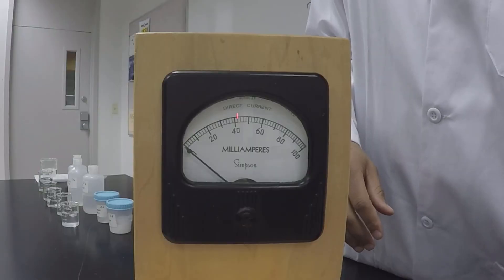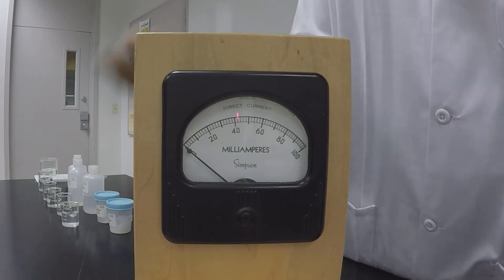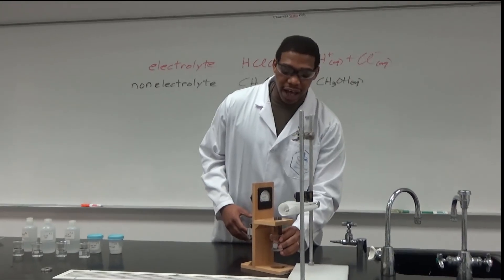As I place it into the meter, we can see that in fact it is non-conductive. It's a non-electrolyte solution because it does not generate any movement of ions.